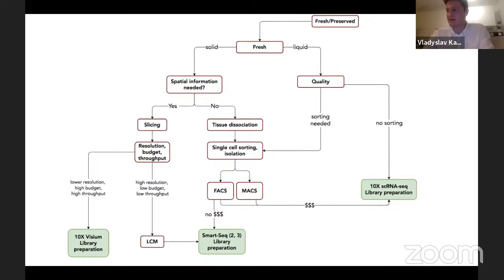That is something you need to consider, because the staining you use must be very quick, since messenger RNA is very unstable. So you need a quick staining that will not interfere with your messenger RNA. For example, you cannot fix your slices with PFA in that case, because PFA will disrupt the RNA and DNA integrity. So you might consider other fixing solutions like acetone.